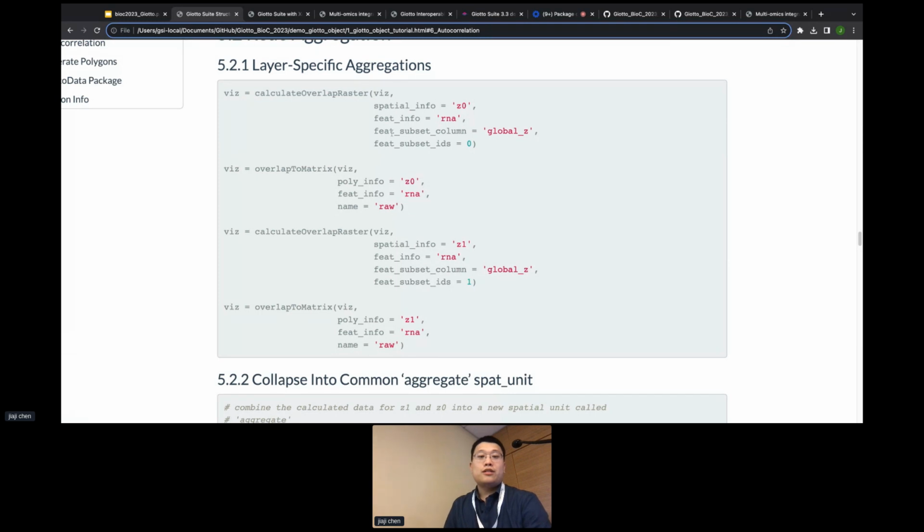Additionally, these are params that we did not use last time during aggregation. This is specifically used to subset a set of metadata that was attached to the points information. I neglected to mention that earlier, but each point actually has a set of metadata that can be attached to it as additional values.